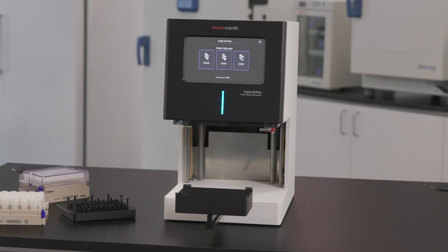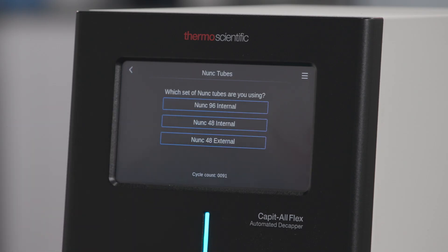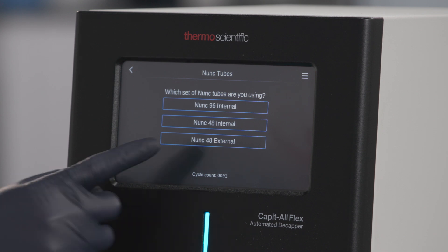To get started, open the home screen and select the tube type you wish to use. If you select NUNC, you'll be given the option to choose from a 96 tube format or a 48 tube format, with either internal or external threads.